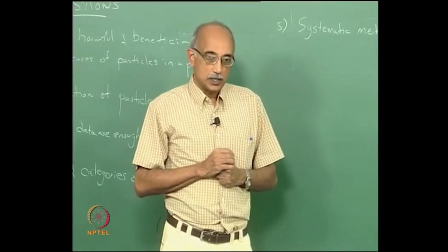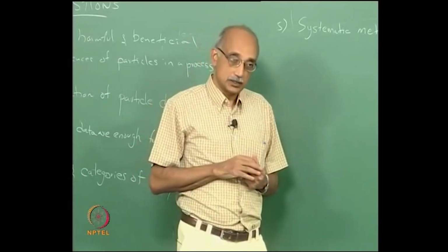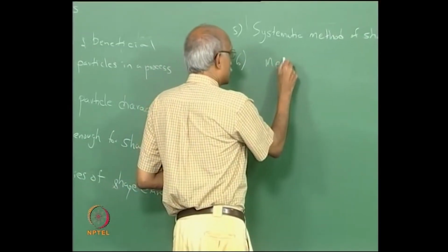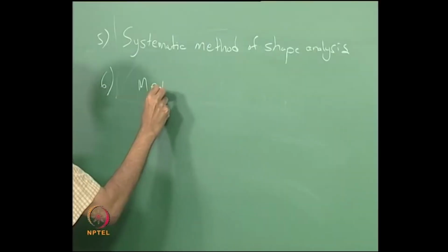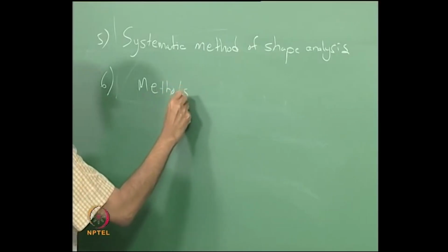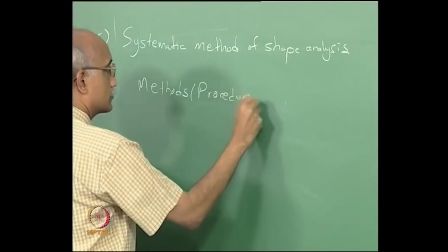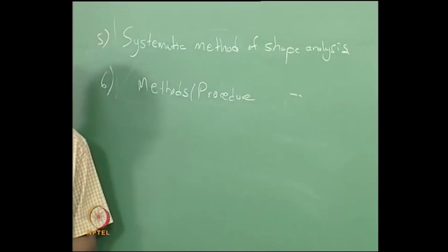And then we talked about various methods of shape analysis, methods or procedures for shape characterization.